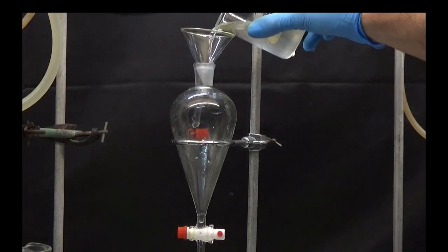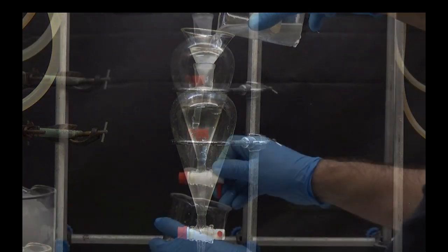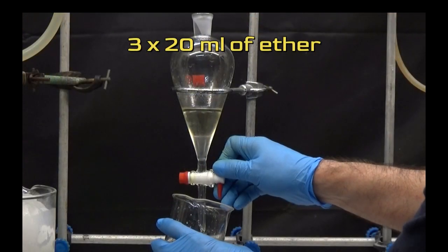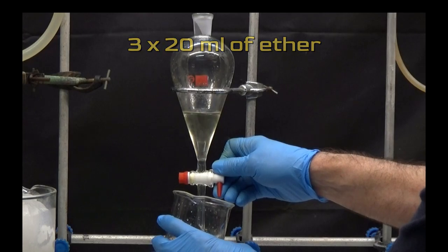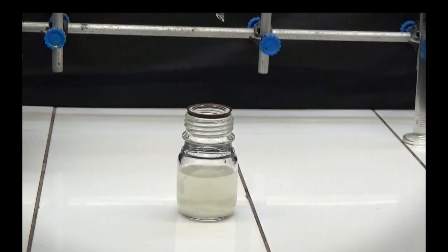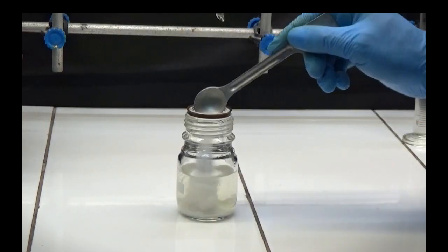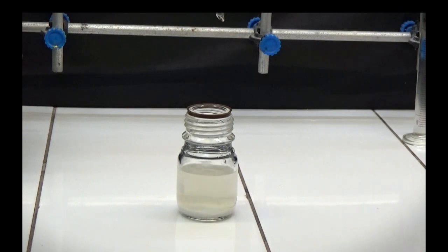Remove the organic layer and wash the aqueous layer three times with 20 milliliters of ether. Dry with anhydrous magnesium sulfate and leave in place for 12 hours.